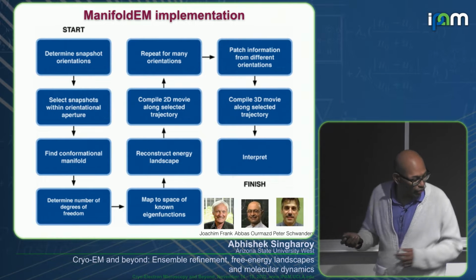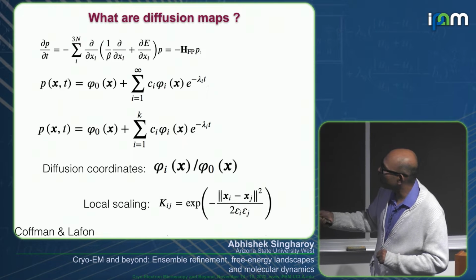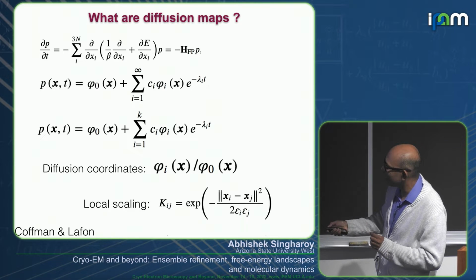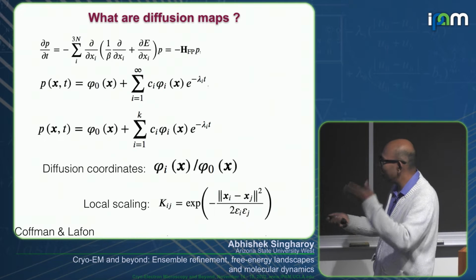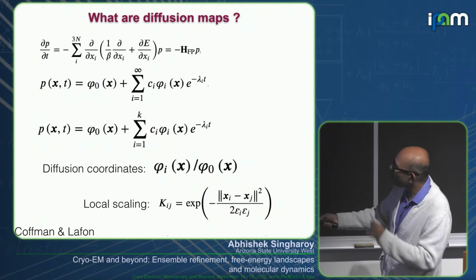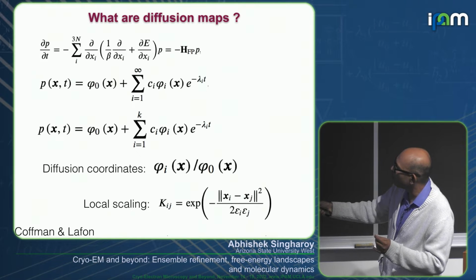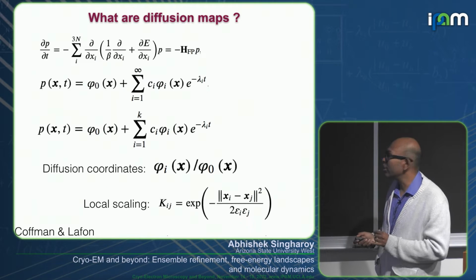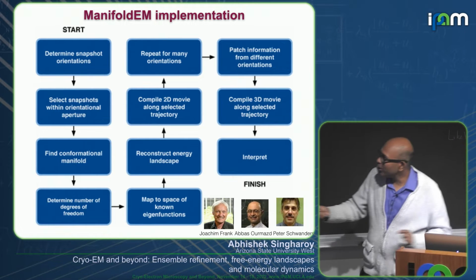The reason for that is, if I go back to these eigenfunctions that we're constructing, a simple form of that eigenfunction is basically differences between two states. I'm telling two states that are the same are actually different. So essentially, that is this kind of a kernel. Oh, I should tell this: this is a simplified version, which is often used in diffusion maps. Turns out the eigenfunction of this particular operator is the same as the eigenfunction of this operator here under certain conditions, and that's what is often used. So it would be difficult, so that problem is there.